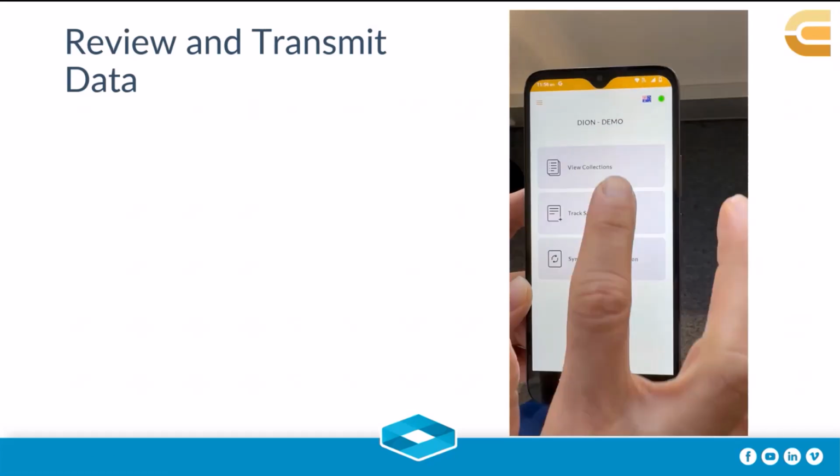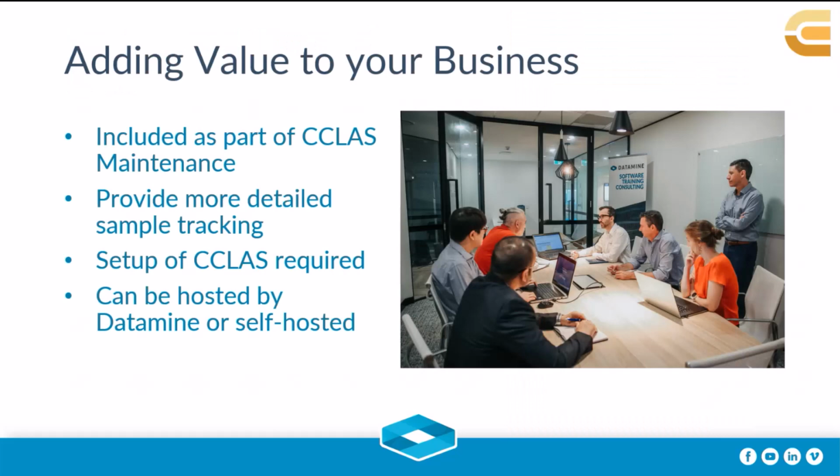Okay, so that's the end of the demo. So moving on to the actual value that this product can be for your particular business or laboratory. For those of you on the webinar that are CCLAS EL customers, the mobile app is included as part of your yearly maintenance, so there's no extra licensing costs for it.